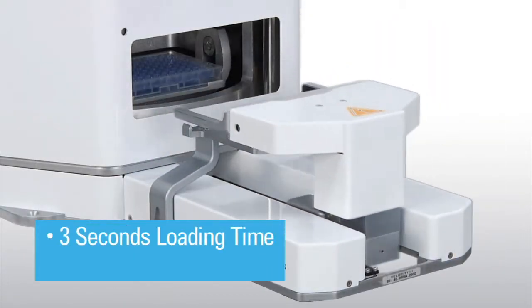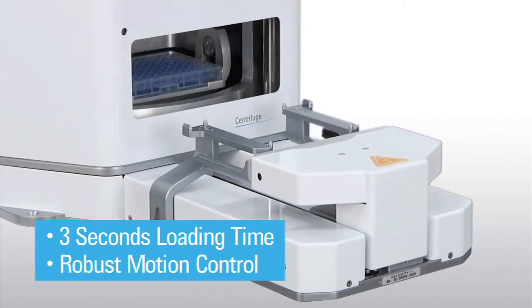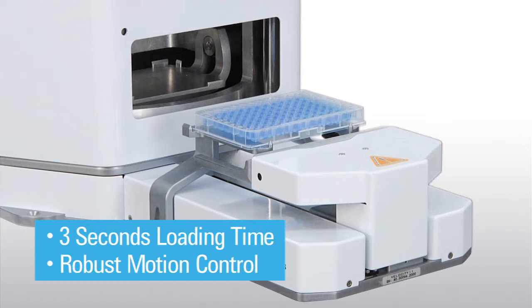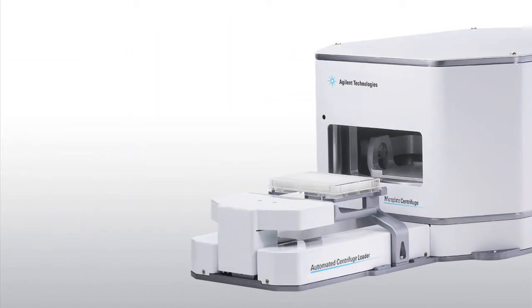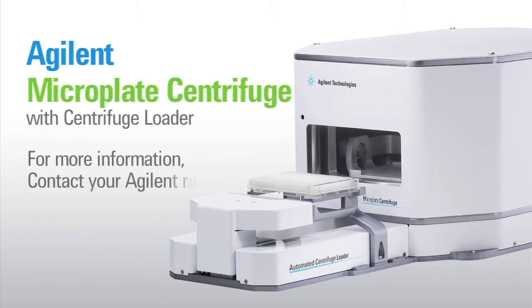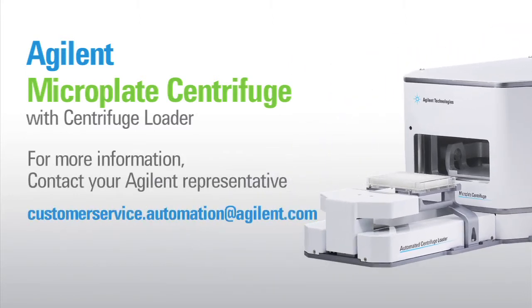With the loader's three-second loading time and robust motion control, the Microplate Centrifuge can be accessed by most laboratory microplate handlers or robots. For more information or to request a quote, please contact your Agilent representative or customerservice.automation at Agilent.com.